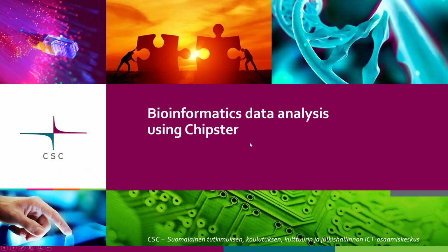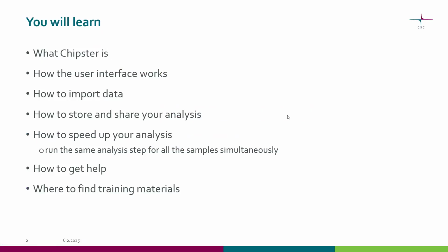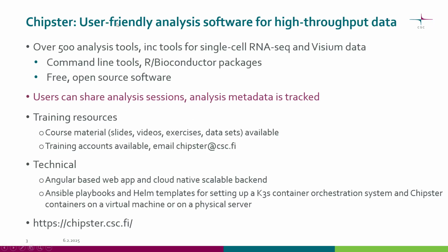In this video, I will introduce you to the Chipster software for bioinformatics data analysis. You will learn what Chipster is, how the user interface works, how to import data, how to store and share your analysis with a colleague, how you can make your analysis faster, how to get help, and where you can find training materials.